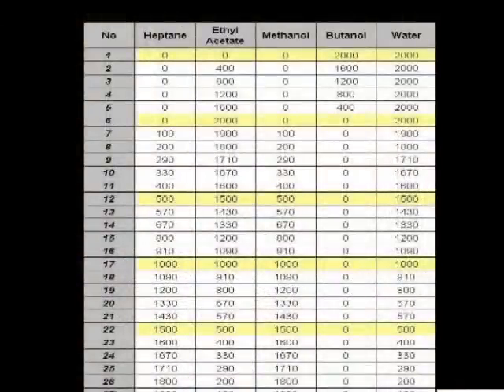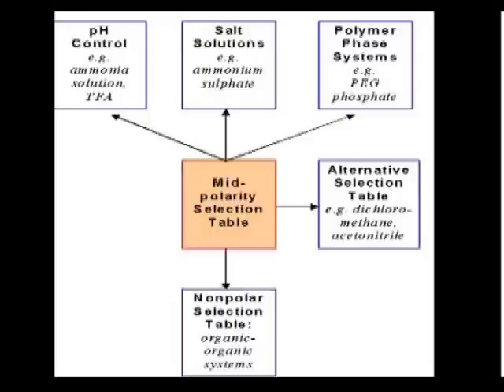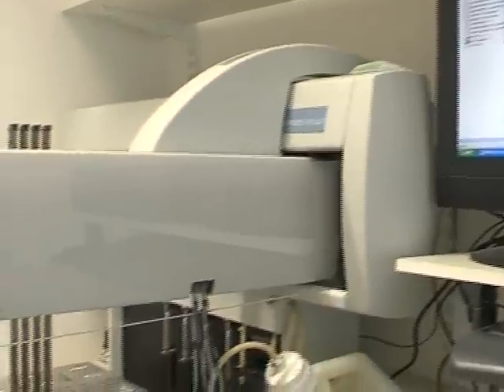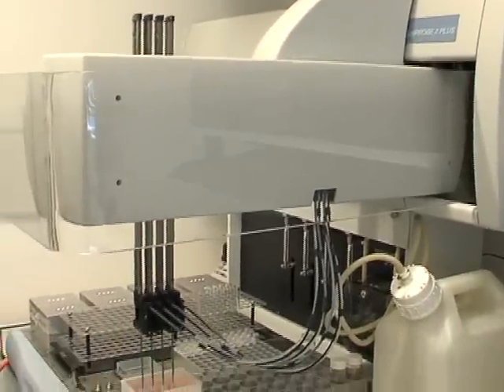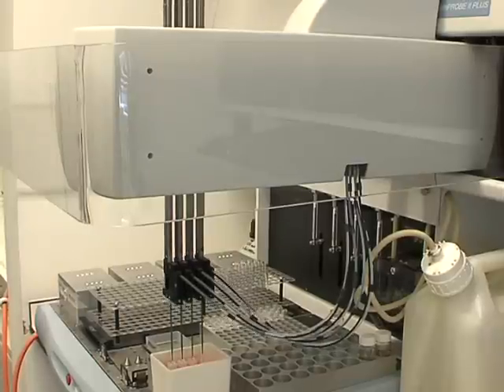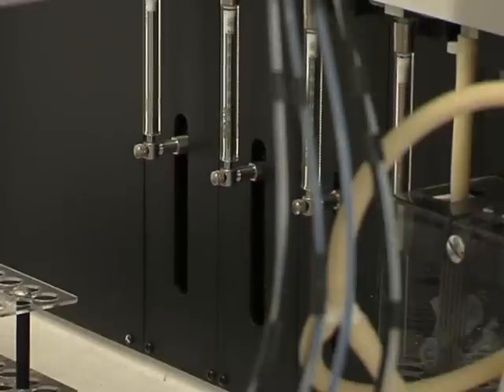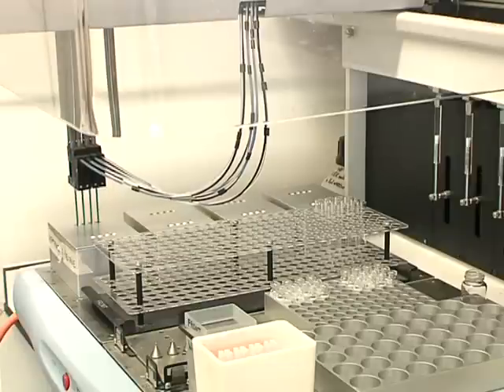This shows a selection table, which covers a range from moderately polar, butanol and water, to non-polar, heptane and methanol. Alternative tables exist for extremely polar and extremely non-polar compounds, and also for employing different solvents to improve solubility. When using the liquid handling robot, all systems are made up in 4 milliliter volume. After phase separation, samples are taken from the top and bottom phases, analyzed by an appropriate assay, which is frequently HPLC or gas chromatography, and distribution ratios calculated from the peaks detected in each solvent system.